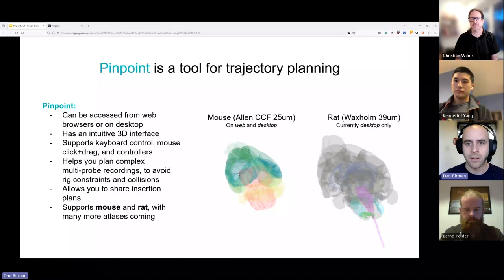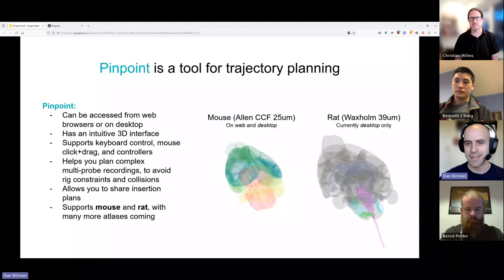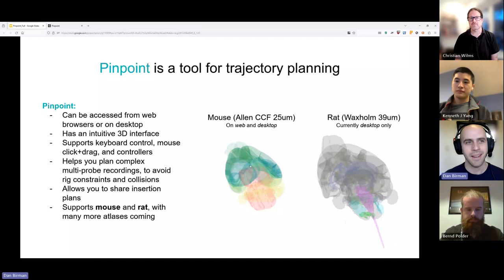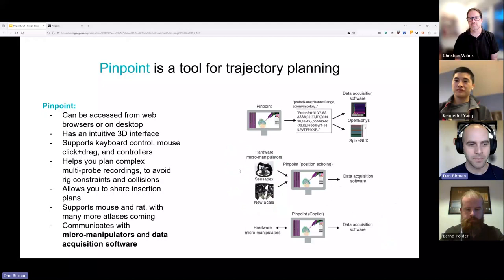We currently support the mouse atlas on both the web and desktop versions. We're also getting support for the rat working right now — we'll have it up by SFN. Currently the rat is desktop only because the annotation atlas crashes the browser because it's too big, but we'll downsample it in the next few weeks. I know a lot of people were asking about rat — yes, it's coming. I'll show it to you live here, but full support in a few weeks.